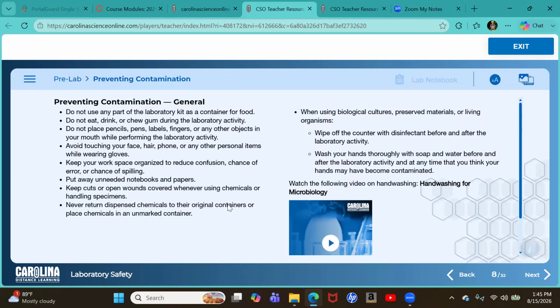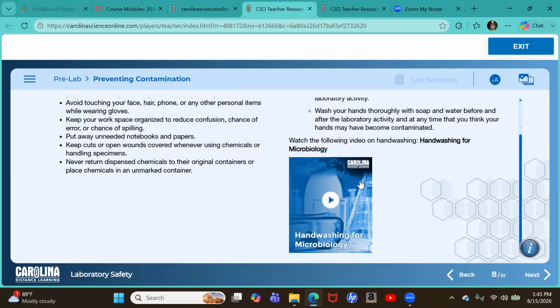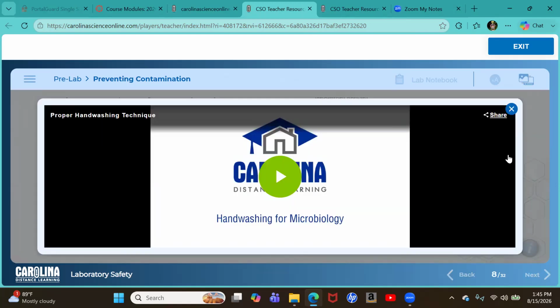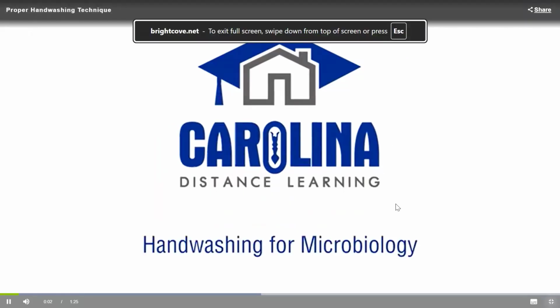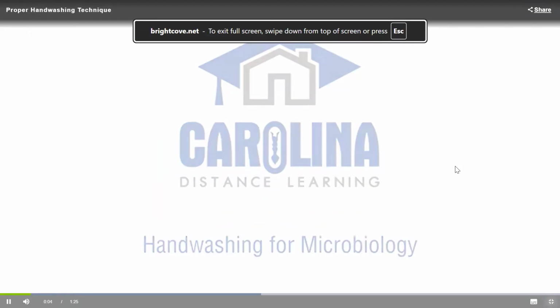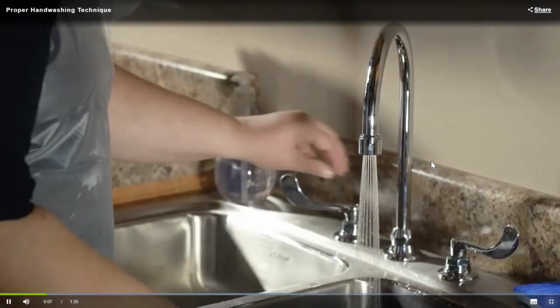The only real chemicals you're going to come in contact with from the kit for this course is the liquid that your specimens are housed in. So we will be doing a sheep brain dissection and a cow eye dissection for this course. So you'll have those two specimens coming. But otherwise, there should not be any chemicals. Hand washing is the best method of preventing contamination. Very important.